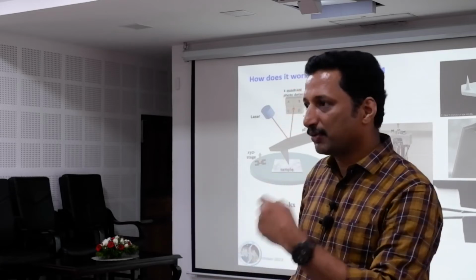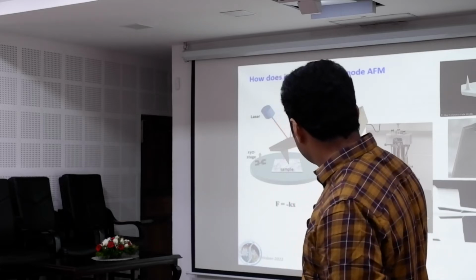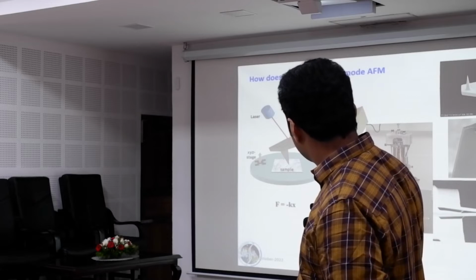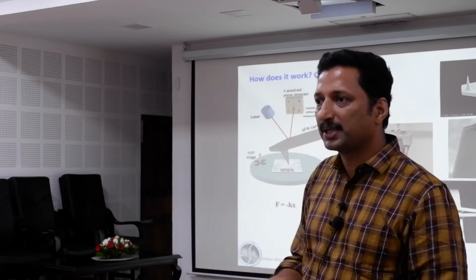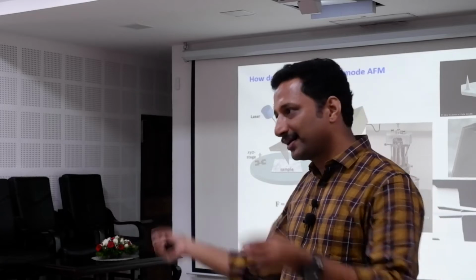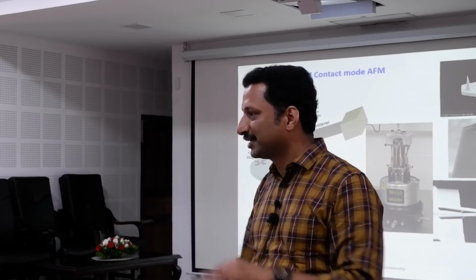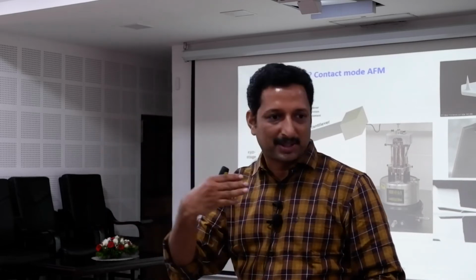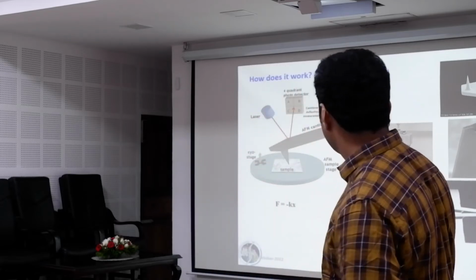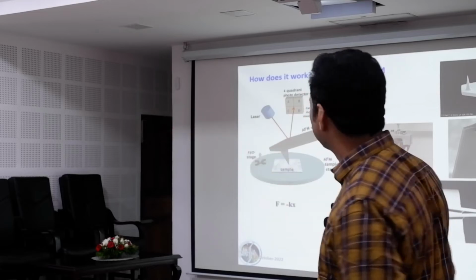Because in any of these techniques we need to avoid vibrations. So all of these are for avoiding vibrations. Again this will be standing on an optical table to avoid further vibration. In STM we put an additional sponge on top to avoid any other vibration. Then also a cover will be there to avoid vibration because of our speaking or sound like that. Otherwise, if a bus goes through IAST, I can see all atoms jumping like that.